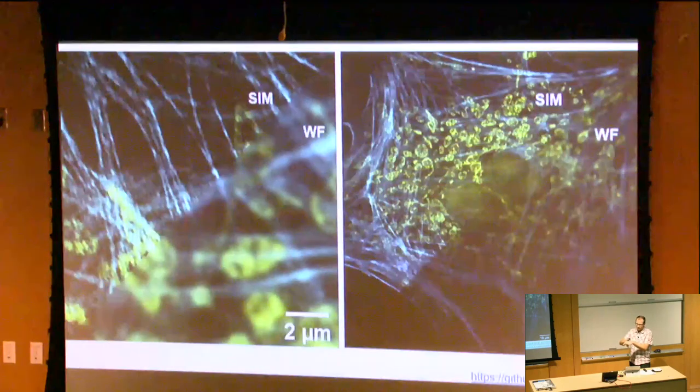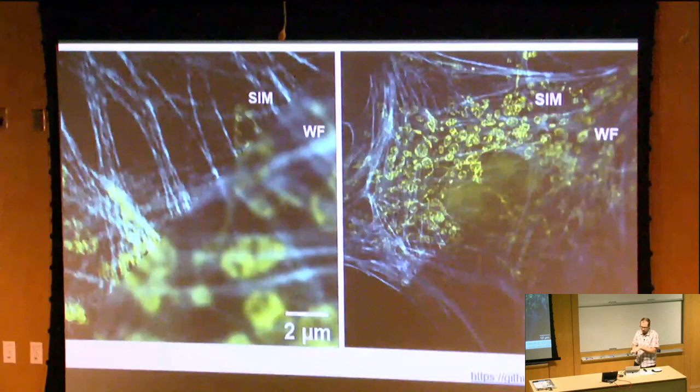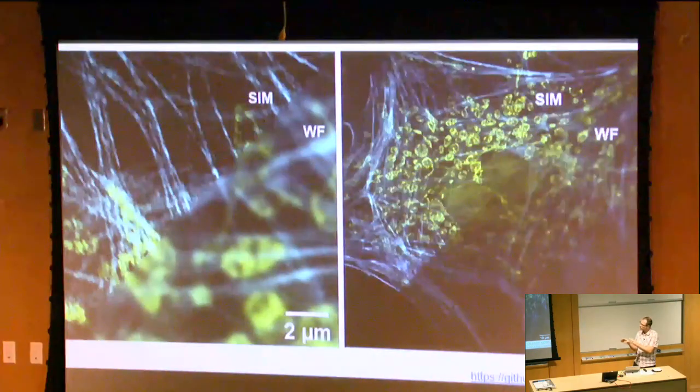That's doable, but every time you add that layer of inference complexity, the computation time goes through the roof, right? One of our collaborators at ASU is really interested in these inference problems. What I can say is it takes about a week for their model to run on a 100 by 100 micron area. So if you don't have somewhat separated signals, it becomes very difficult to find individuals.